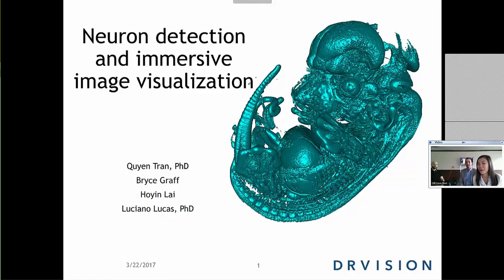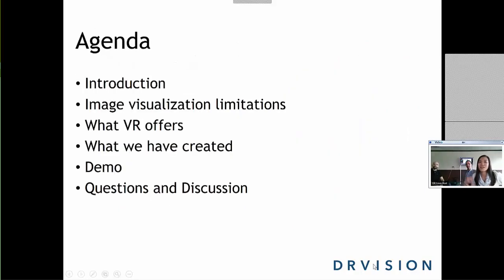Thank you for coming to our webinar today, in which we'll be discussing with you our work on virtual reality for life science research. So before we start, or restart, I'm going to go over the agenda very briefly. We'll do a brief introduction today. We'll talk about image visualization limitations currently, what virtual reality offers, and what we at DRVision have created. We'll also go through a short demo with you and have time for questions and discussions at the end.